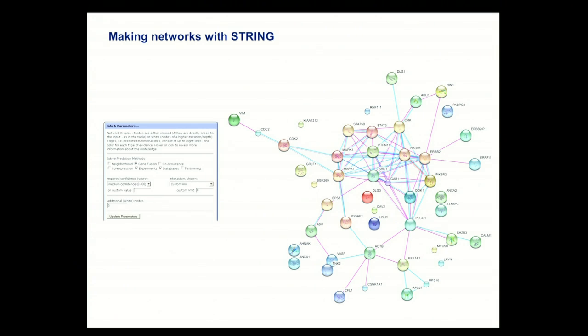One of the major drawbacks, I think, of the STRING database until the new version that just came out was that it didn't have a statistical test on these networks. But I just saw the paper came out, I think, 2 days ago, and in the new version of STRING they actually implement a test, much like DAPPLE, where you throw in your set of proteins, and then STRING figures out whether there is a significant amount of connectivity between your proteins. I think that was a key element that was really needed in this type of analysis, and it seems like that's up and running now.